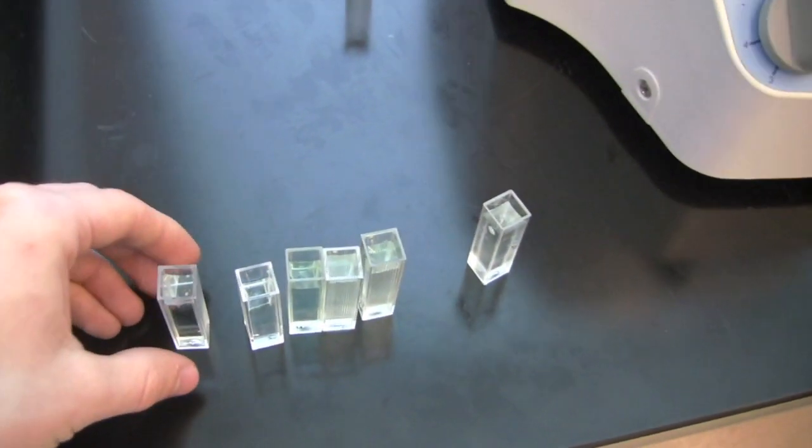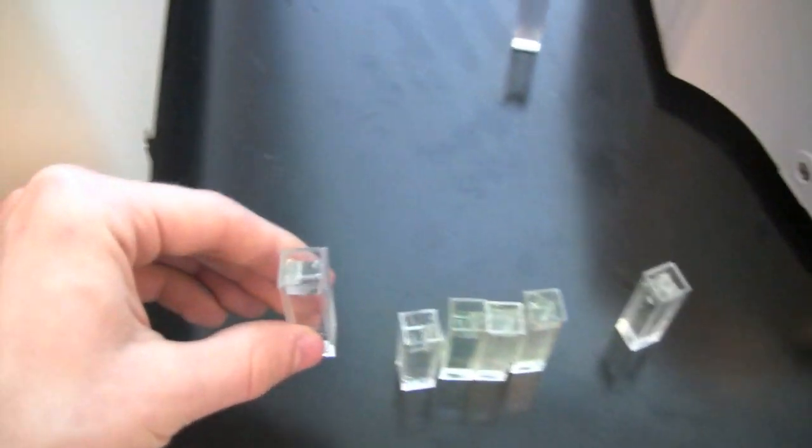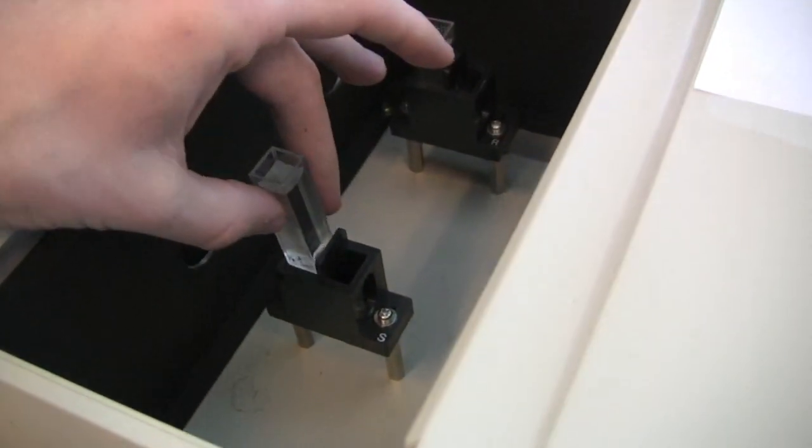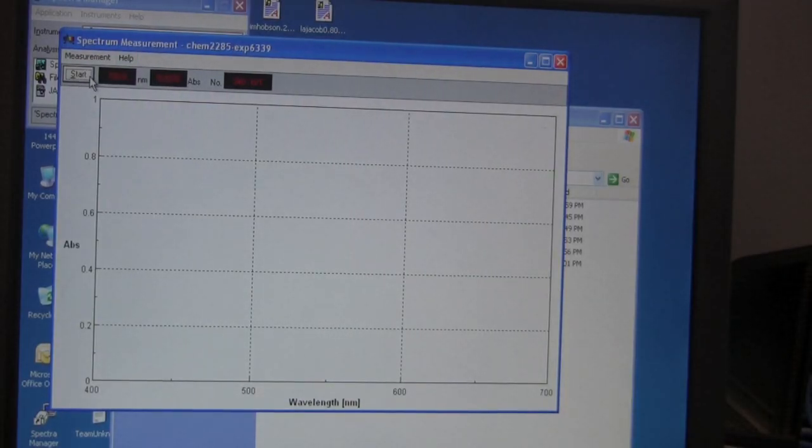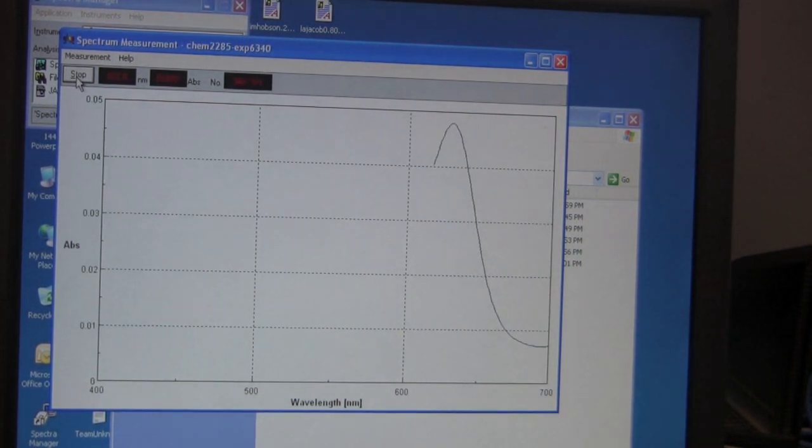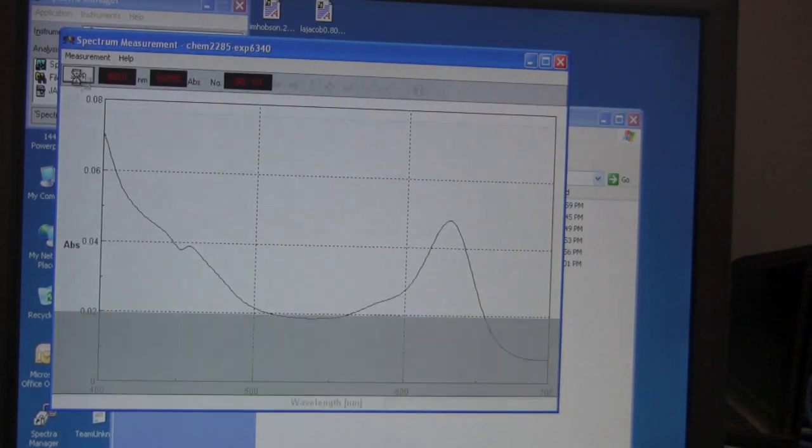Take the first cuvette which should have 0.2 over 25 milliliter concentration solution. Place the clear side facing the direction of the beam of light. Close the hood and with the spectrophotomanagement program, click the start button and allow the program to measure the absorbance versus the wavelength of the substance that you put in the spectrophotometer.